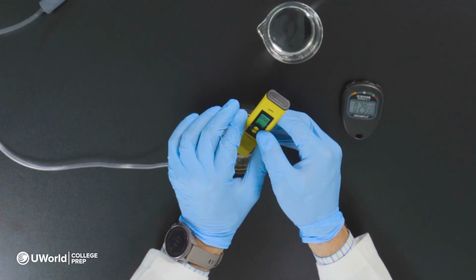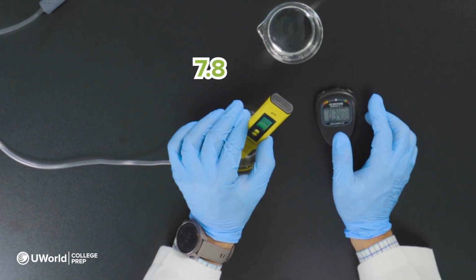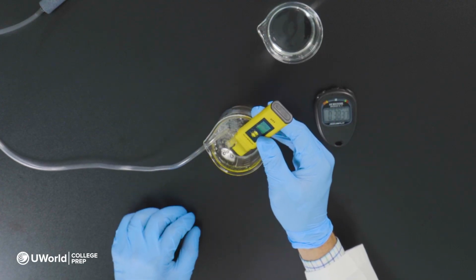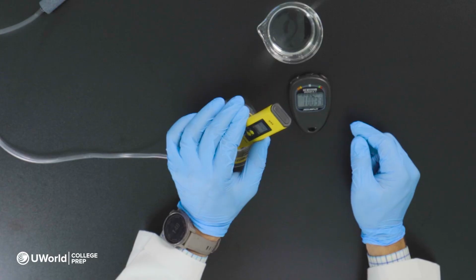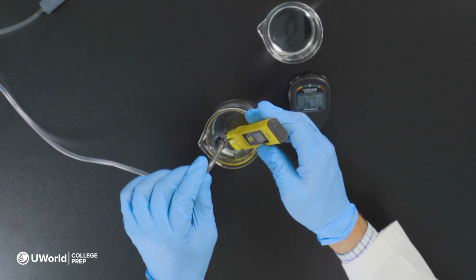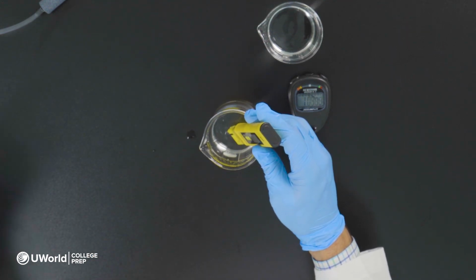And after 30 seconds, we're still at 7.8 for pH. So again, nothing is changing with our air stone. And then we're about 7.86 after a minute, and we're going to take this out and measure the pH for another minute or so.